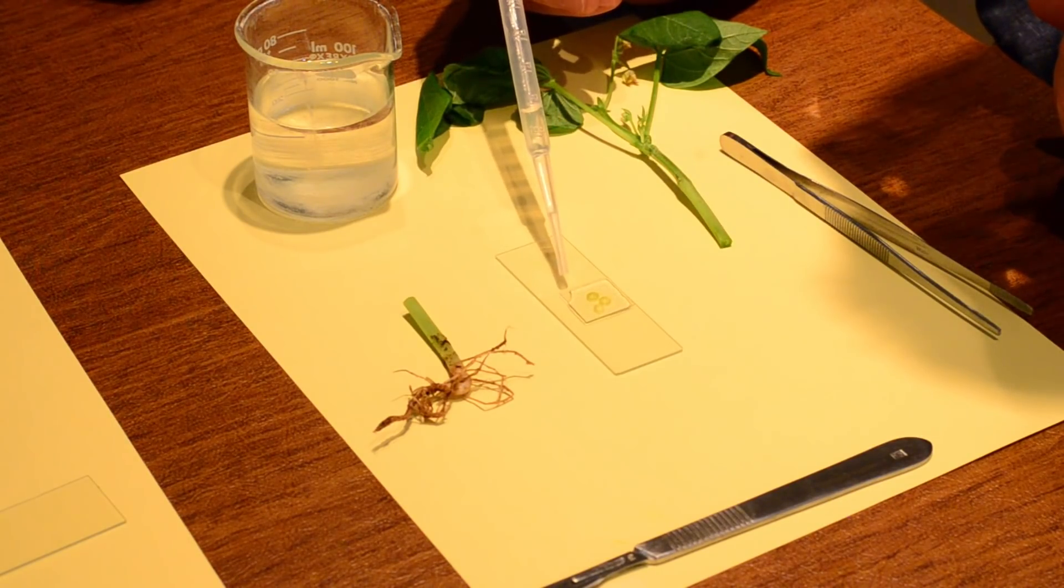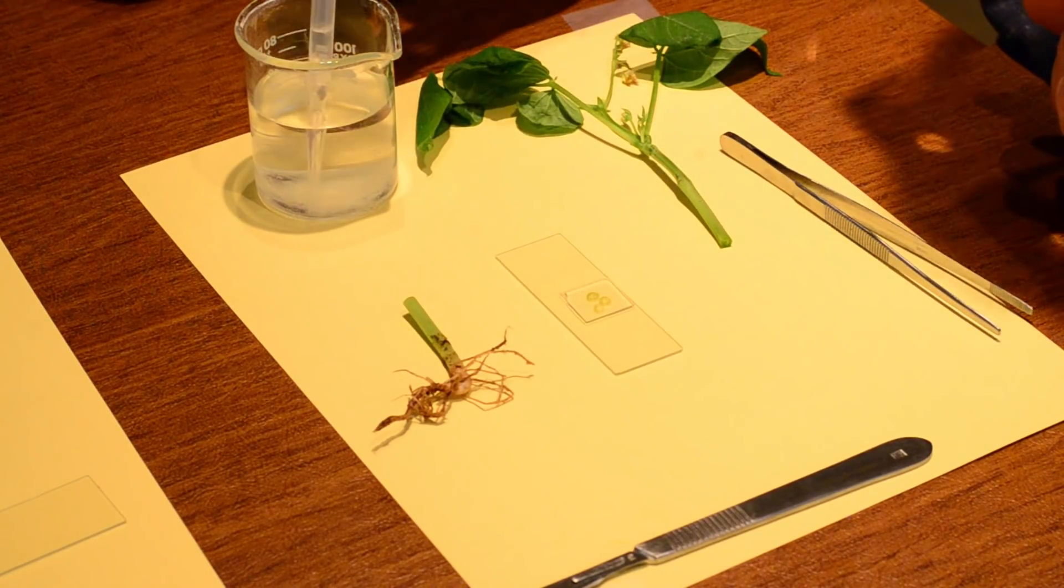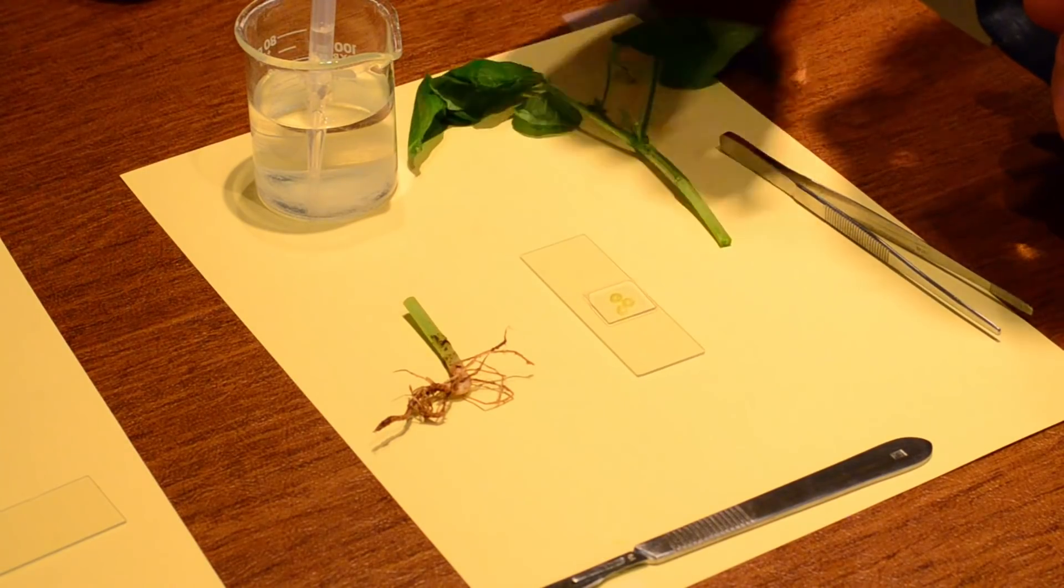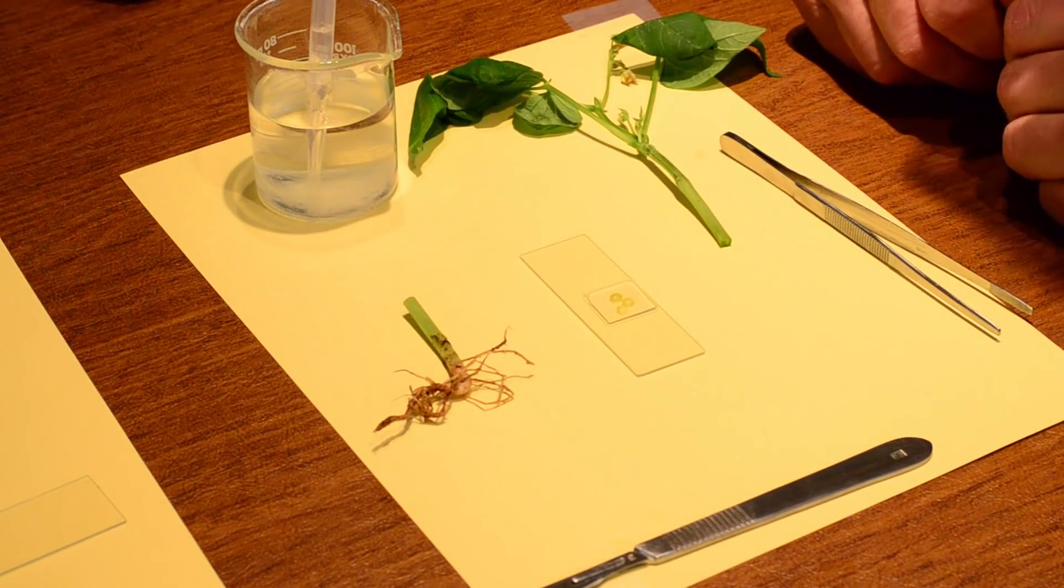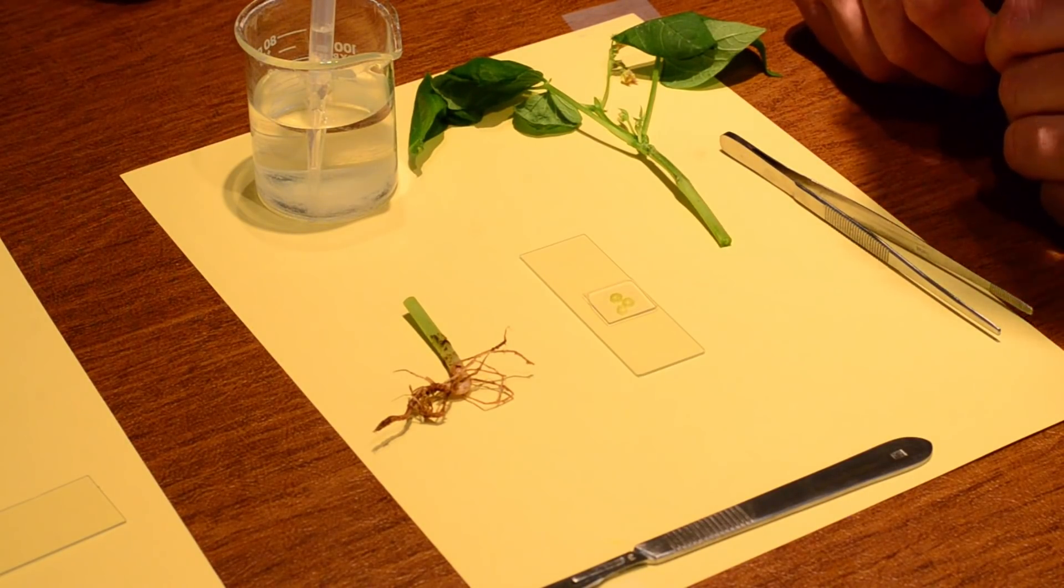And when I put this under the scope, I only need one. And I need a couple just to kind of demonstrate. But that is beautiful. Wonderful patterns. And we'll be able to see the xylem and phloem and where the food and water would travel through in the plant.